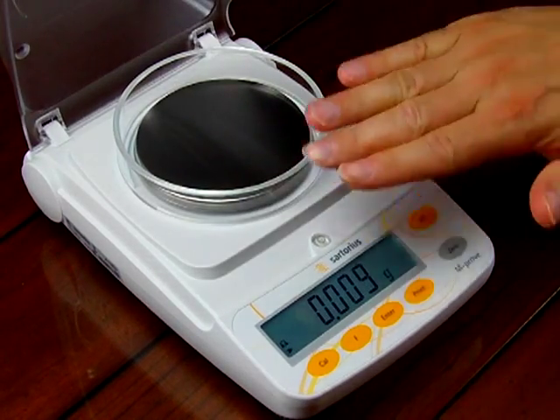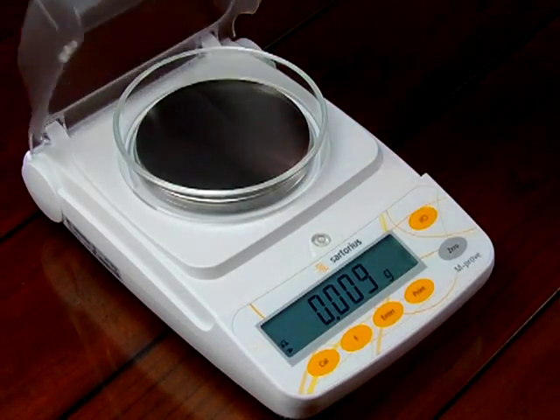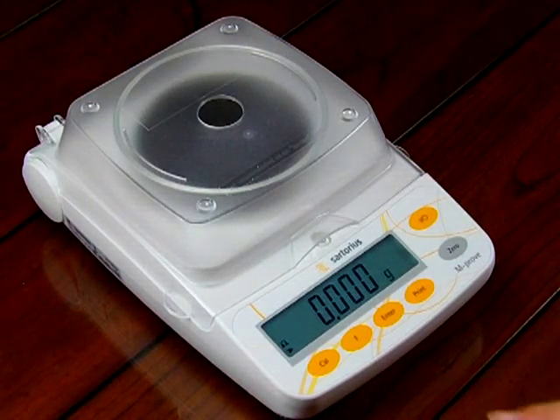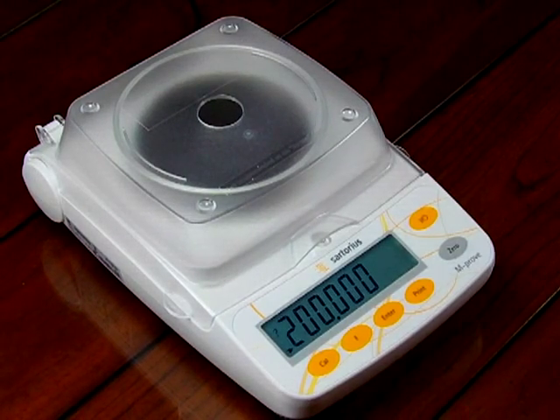I want to have this cover closed so that you watching this video know that the numbers aren't moving because of a breeze. So I'm going to keep this closed. And I'm going to tare the balance first. And I'm going to go into the Cal mode by simply pressing the Cal key. It says 200 grams — that's the standard for calibration. On this particular balance, the AY303, we have the choice of calibrating with three different weights: 200, and if I hit the F key, there's 100, and then there's 50.